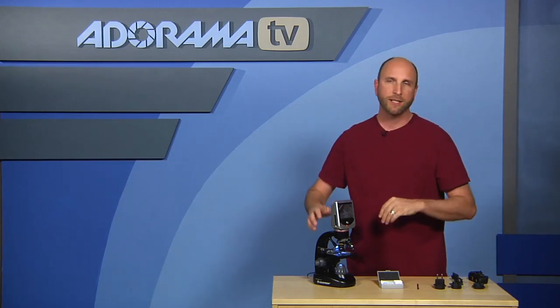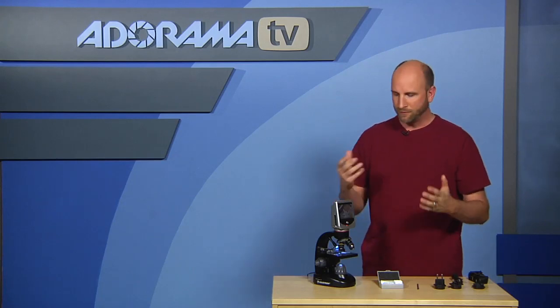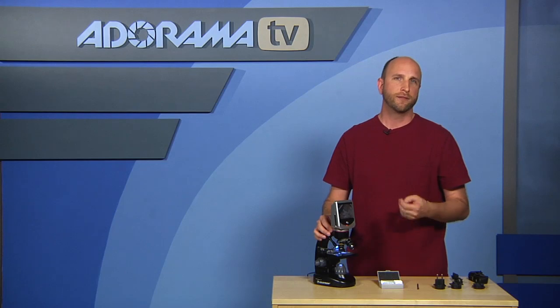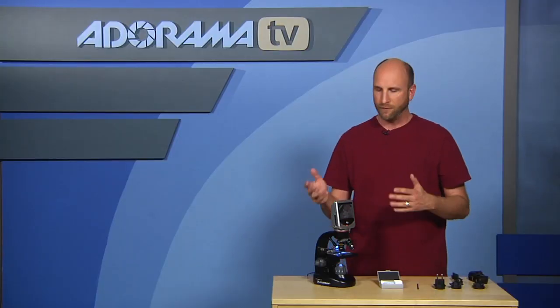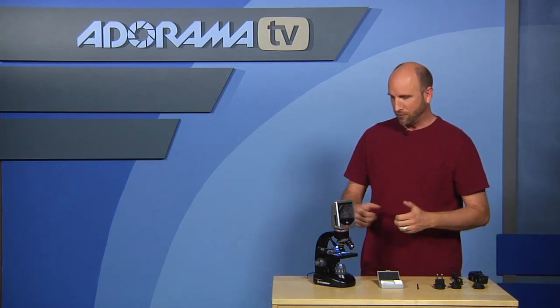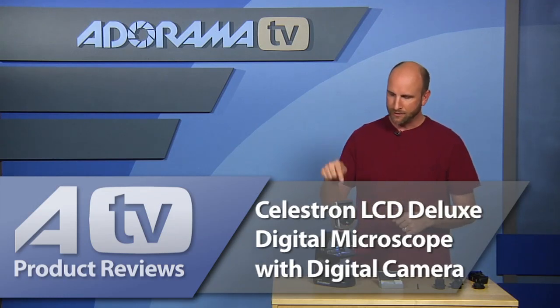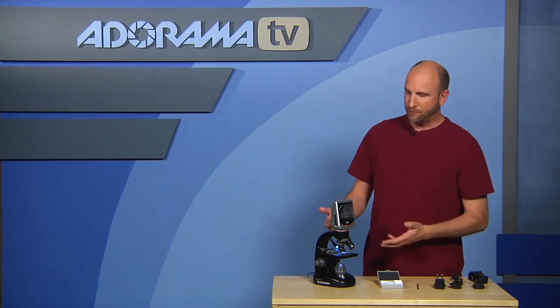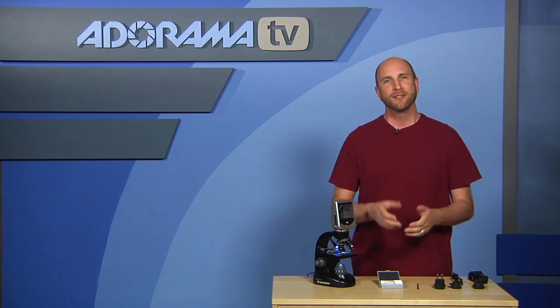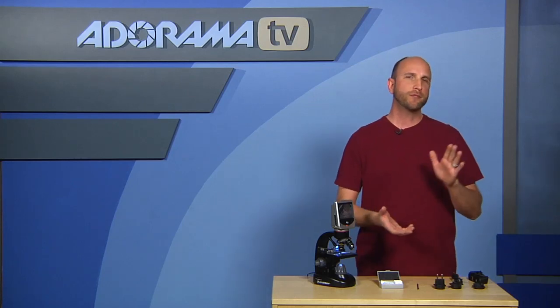So if you're really curious and like to dig in, or you know somebody younger who's curious and wants to explore, or maybe you're a teacher who needs a device for training and capturing still photos for presentations — there are all kinds of uses for this digital camera microscope. The whole thing is the Celestron LCD Deluxe digital microscope with a built-in digital camera. The complete package with the case, slides, and everything is $250. I highly suggest it — it could make an awesome Christmas present, birthday gift, or a great tool for a young student.